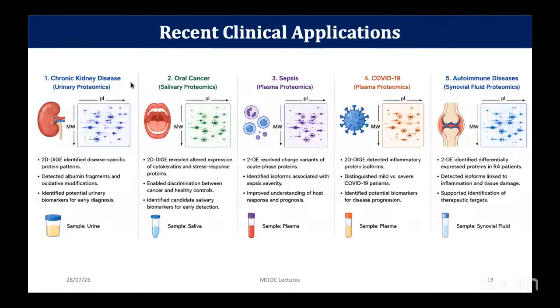So now let us come to the application, where 2D DIGE has been very important. As I initially told, you can do analysis with the urine, the saliva, the plasma, as well as the synovial fluid. You can find the papers which I have shared in your study link.